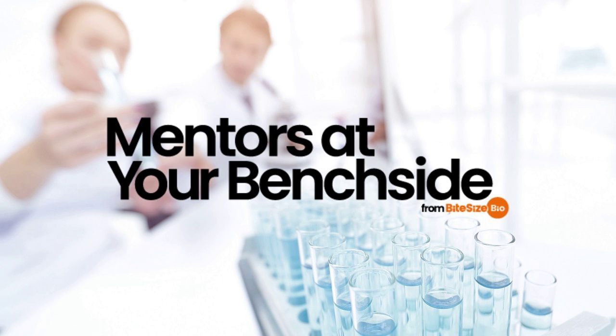And what about disinfection? Aside from substantial differences in cost, it doesn't really matter which ethanol grade you use for disinfection, so most labs use a denatured stock. What does matter is the final ethanol concentration. Ethanol is a disinfectant at concentrations between 70 and 90%. Although it may seem counterintuitive, 70% ethanol seems to be the most effective concentration, as 90% ethanol coagulates proteins, and the protein layer that is created effectively renders the cell dormant.